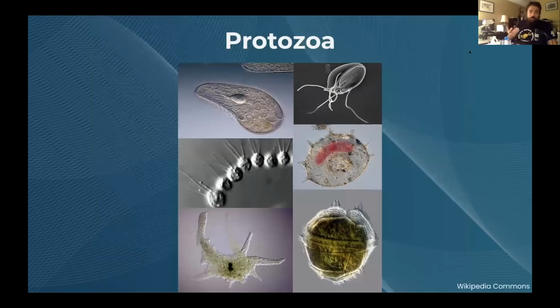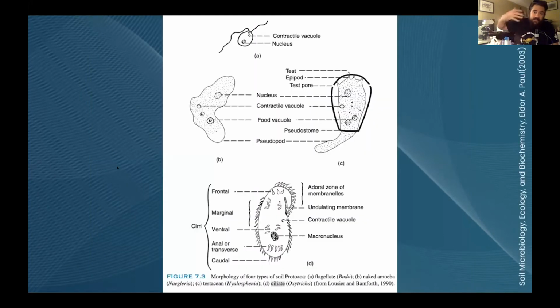So we have the protozoa. Counterclockwise from the top left, we have our ciliates, our flagellates, our testate amoeba, and, oh, I forget that one. And we have also our free living amoeba in general and other flagellates. These are really interesting because the composition of them will indicate whether our soil is in kind of an anaerobic situation, more of a dirt, or more of an actual soil, an aerobic environment. Usually the ciliates show up in more anaerobic conditions. But these are the organisms that play pivotal roles in feasting upon the different bacteria and certain types of fungi as well. Basically different morphologies.